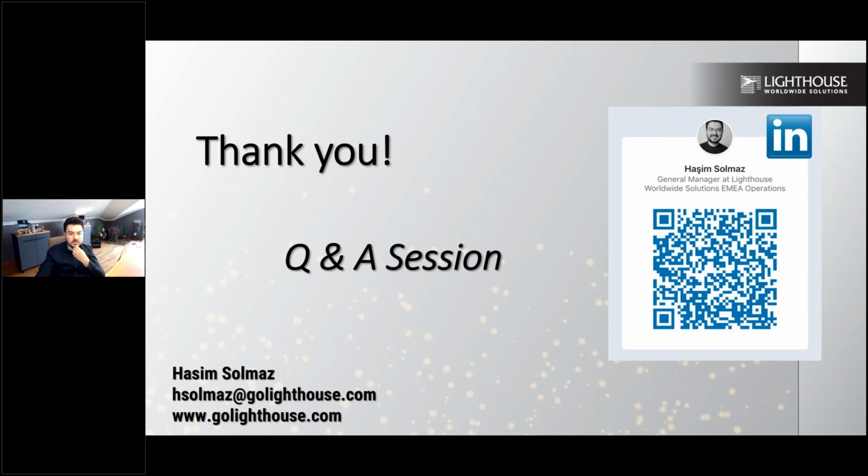Since the flow volume in most airborne particle counters is controlled by a set flow rate and a period in which the particle module is active, is the timing critical? Most particle counters have a flow rate measurement inside, especially Lighthouse. We have flow meters inside each and every particle counter.